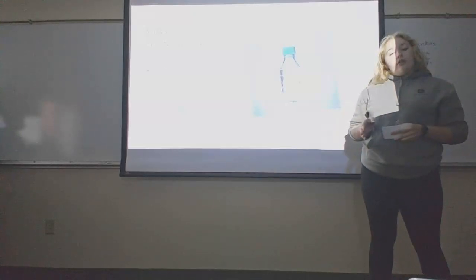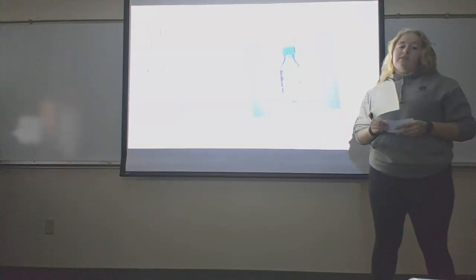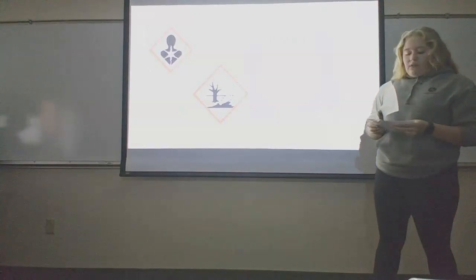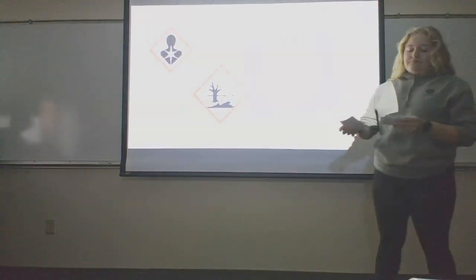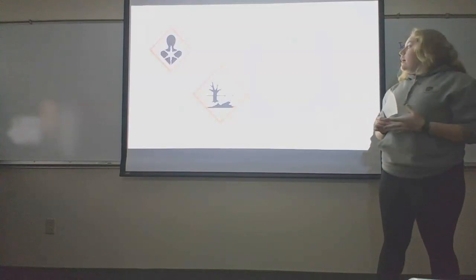So although vial 20 also showed the CCl, like I said before, it's irrelevant because benzene rings can present in the lower end of the graph. Paraxylene also forms hazards. In this case, there are human health risks.